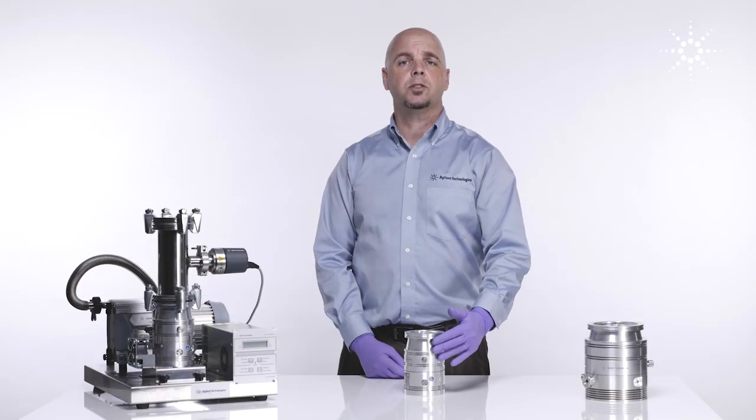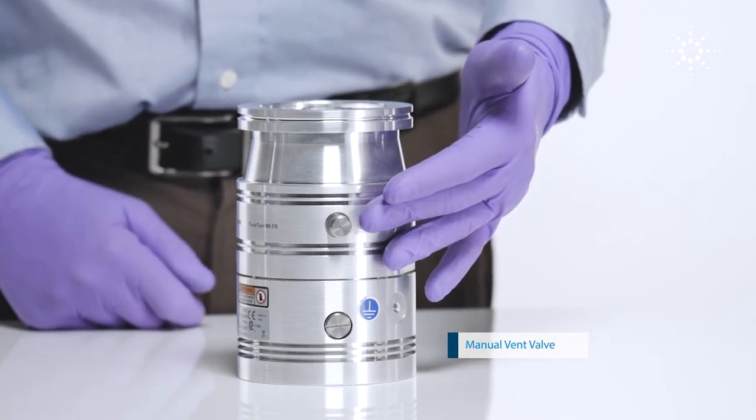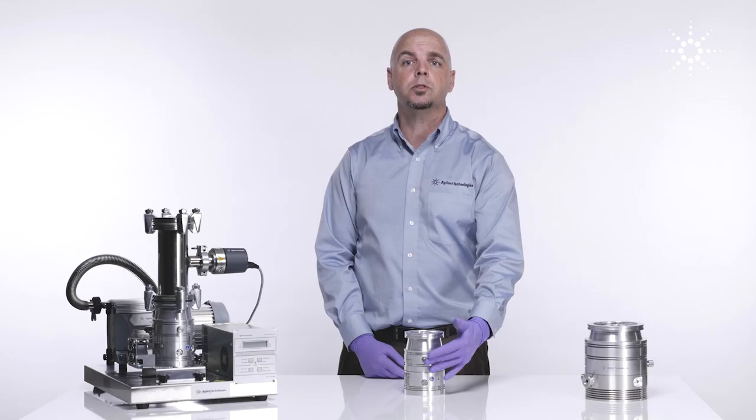As we work our way down the turbopump body, we get to the manual vent valve. This manual vent valve is used to slow the rotational speed of the turbo during shutdown.